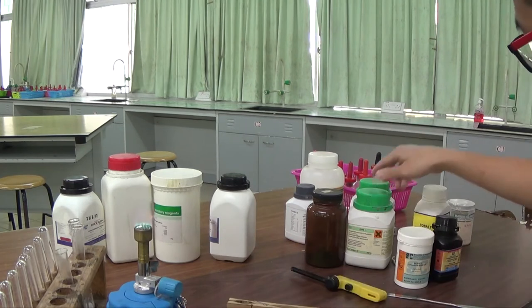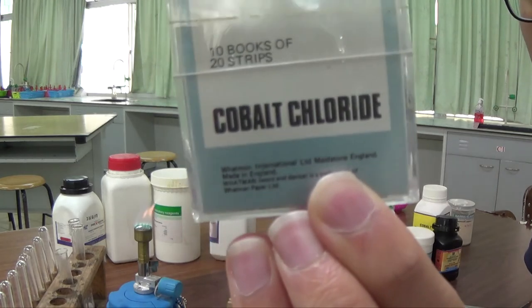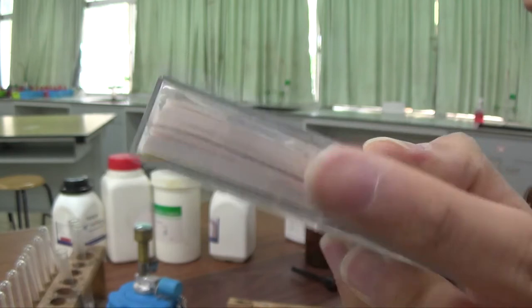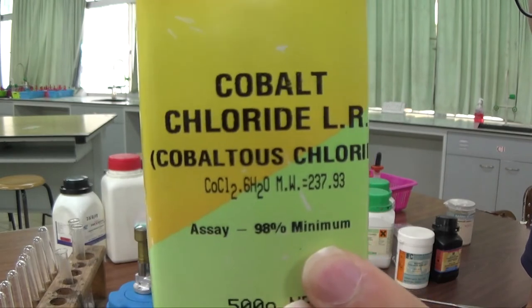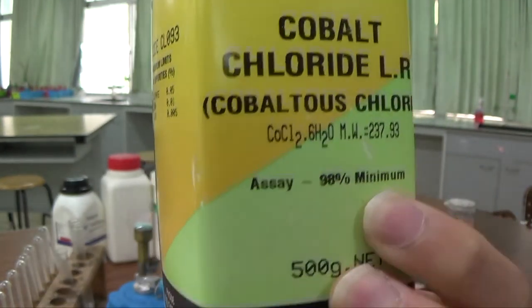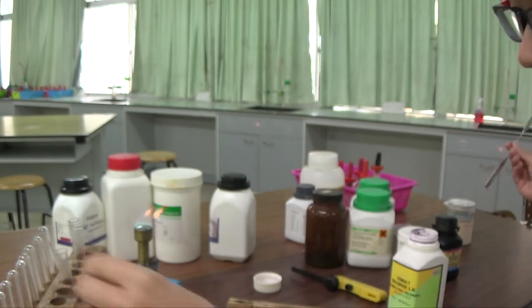Okay, so remember we're supposed to test for the presence of water using cobalt chloride, which is not supposed to be pink because pink means it's hydrated. It's supposed to be blue. Okay, so I'm going to start out with this cobalt 2 chloride, CoCl2.6H2O. It is a pink colored solid. I will heat it until all the water has been removed.